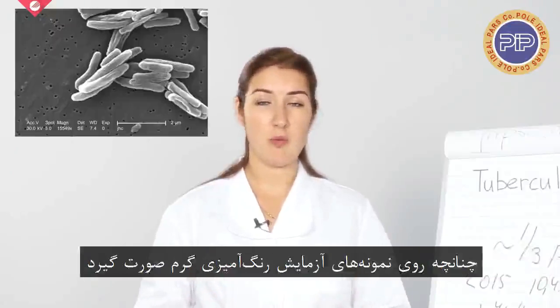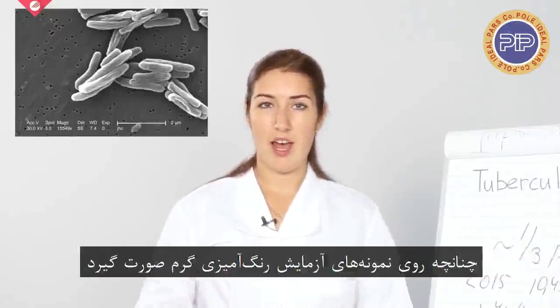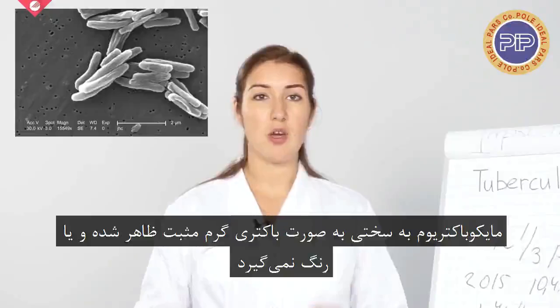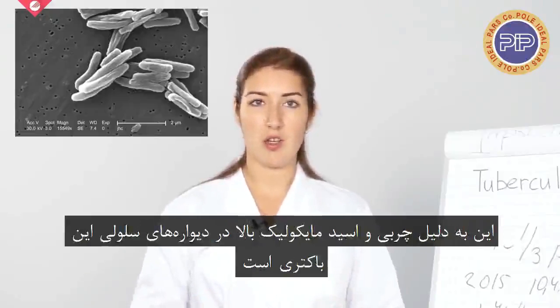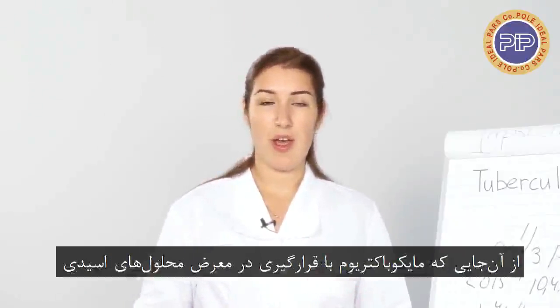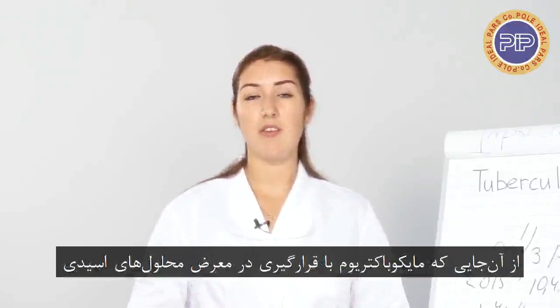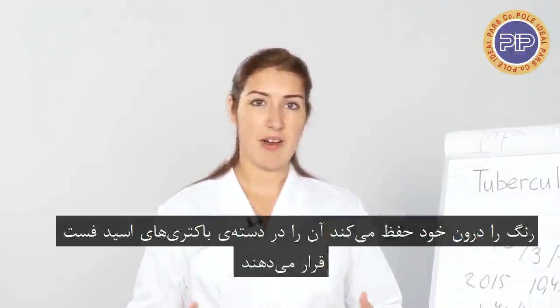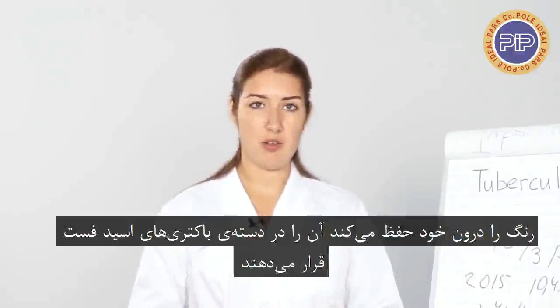If the Gram stain is performed on the clinical samples, then Mycobacterium either stains very weakly Gram-positive or does not retain dye because of the high lipid and mycolic acid content in its cell wall. Since Mycobacterium retains dye even if it was treated with acidic solution, it is classified as acid-fast bacteria.